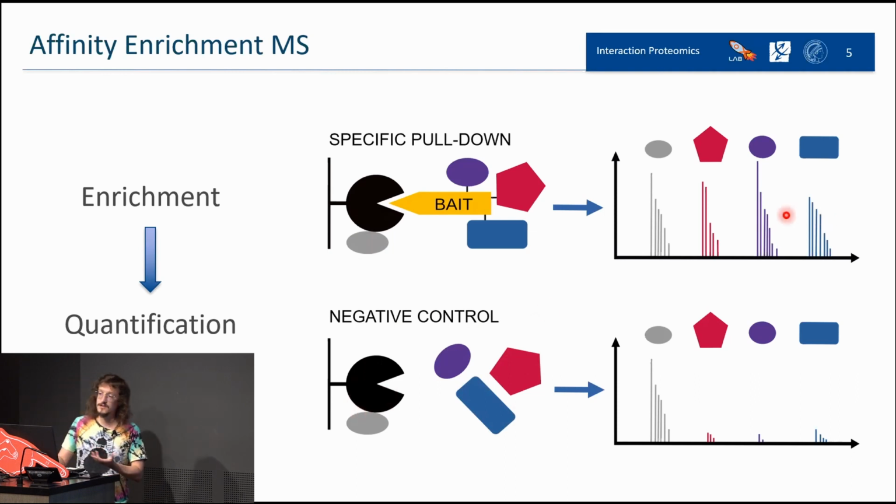And the result you can see here: you expect that when you take the sample and perform proteolysis and then mass spectrometry and everything, in the first condition you will have an output from the mass spectrometer coming from all proteins, specific binders and unspecific binders. While in the negative control, all the specific binders will be washed out, and the only proteins that will remain will be the unspecific ones. As you can see here, we have signal only from the gray ones.